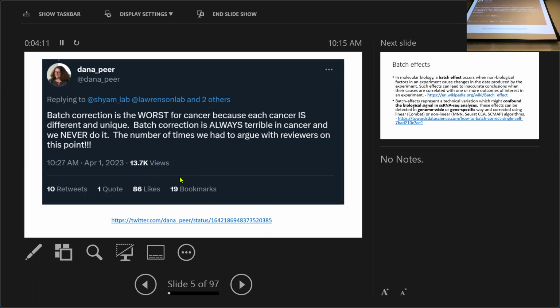So this is my sample one. I did this for sample two. I also put 50% of this and 50% of this, mixed, as my sample three. Of course, this was on the same machine and the same batch. There's no difference.